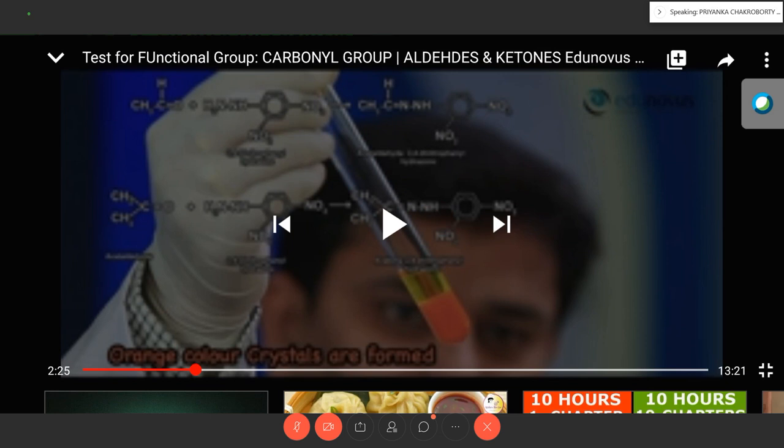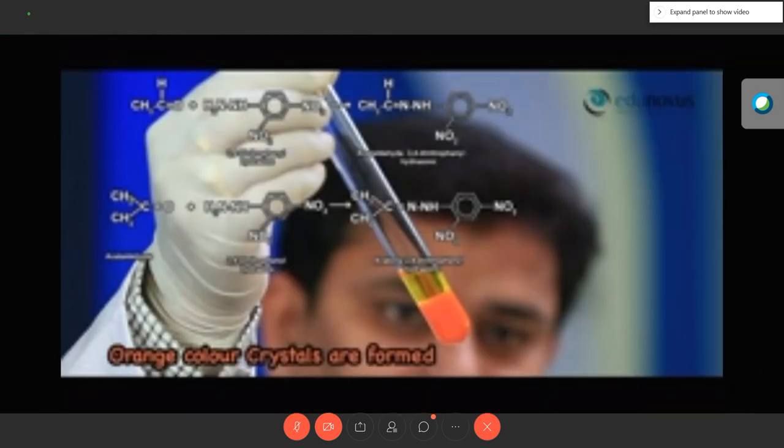This yellowish reddish orange crystal is the 2,4-dinitrophenylhydrazone. The C=O in the carbonyl group condenses with the hydrazine NH2 and gives you that molecule, that is C=N-NH-2,4-DNP. That is the reddish orange crystalline, not muddy, precipitate. It is crystalline; shiny crystals can be seen in this reaction.